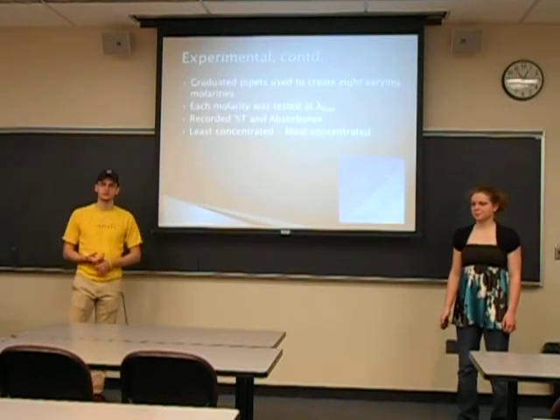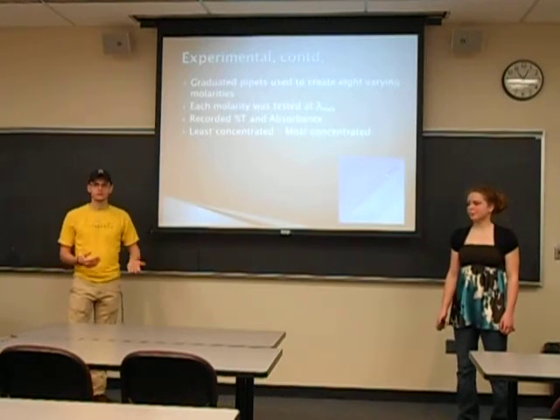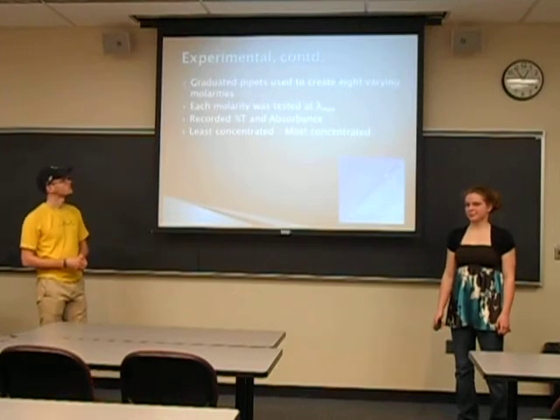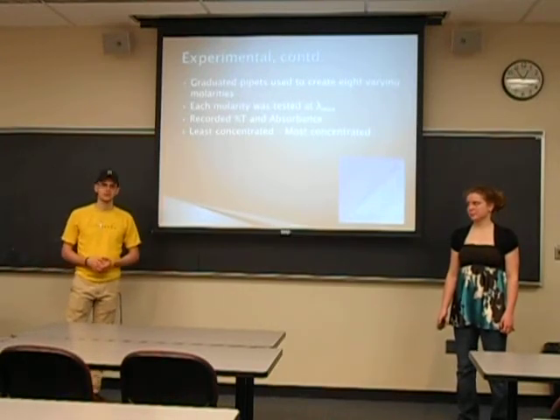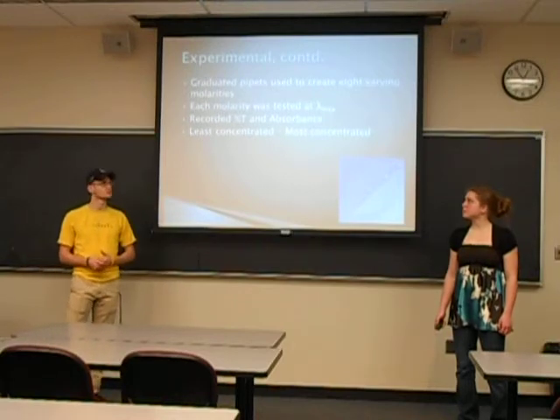The second part of the experiment is you use graduated pipettes to create 8 varying molarities of your cobalt-2 chloride. Each molarity is tested at your lambda max, and you also record percent transmittance and absorbance.